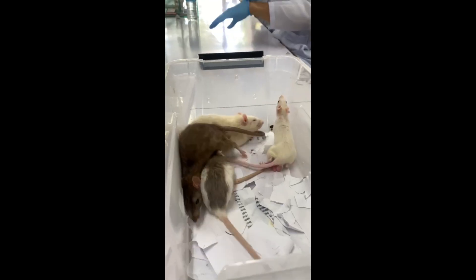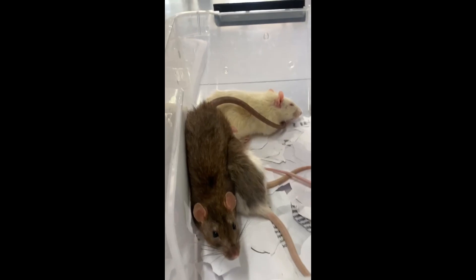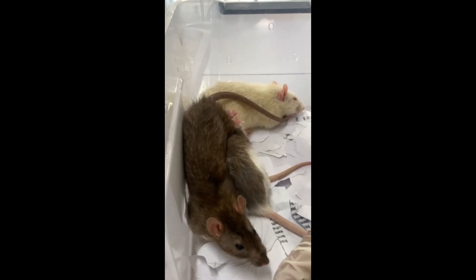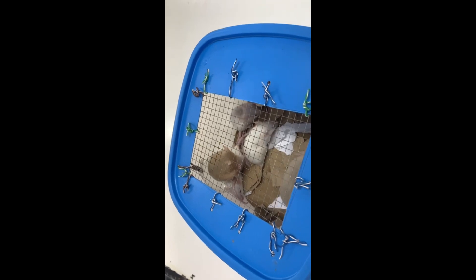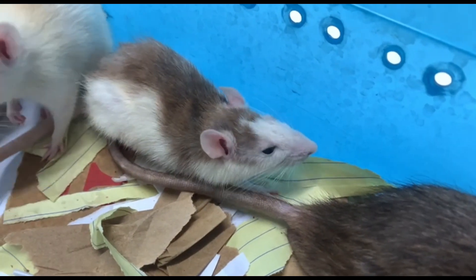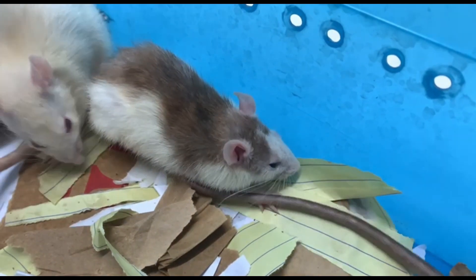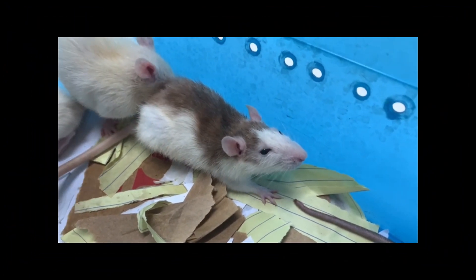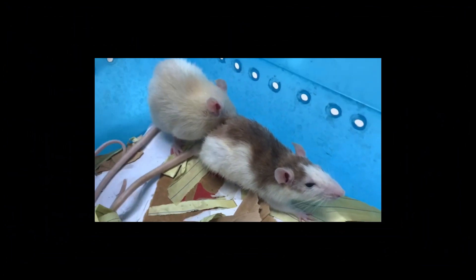A proper and gentle approach is advisable to minimize the stress of the animals and reduce the risk of bite injuries to the handler. Most rodents will attempt to bite when handled improperly, and the wounds they inflict can be painful and prone to infection. To avoid being bitten, it is important to keep the animals aware of the handler's presence before the first attempt at restraining them.